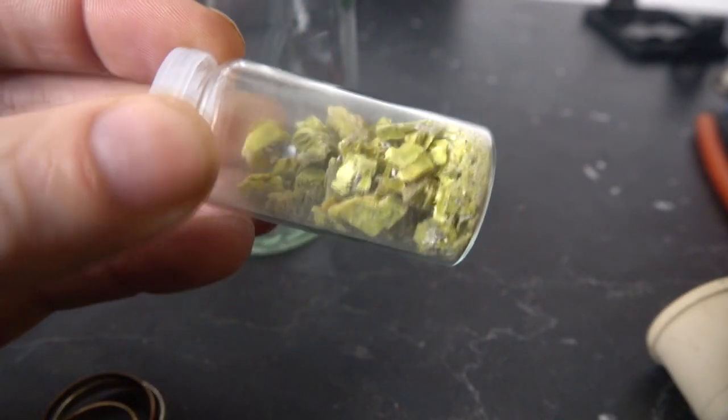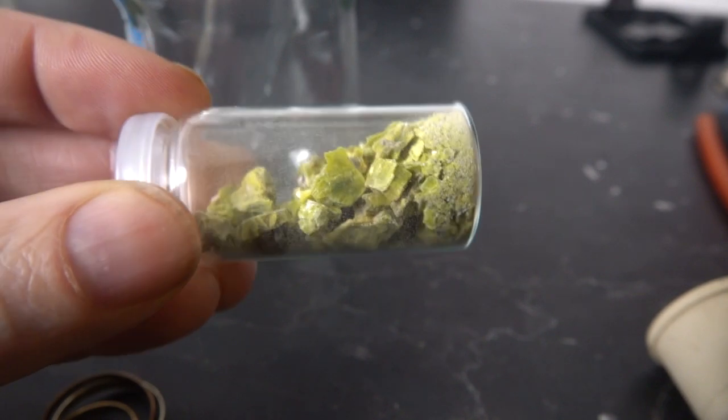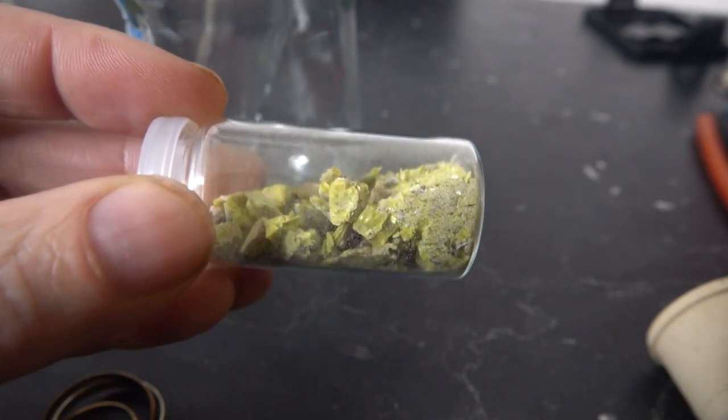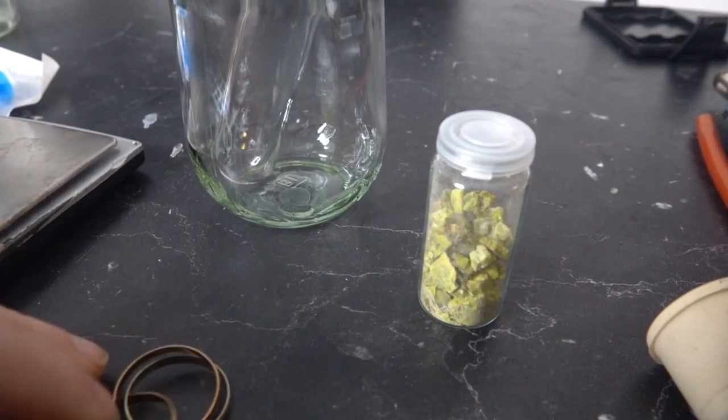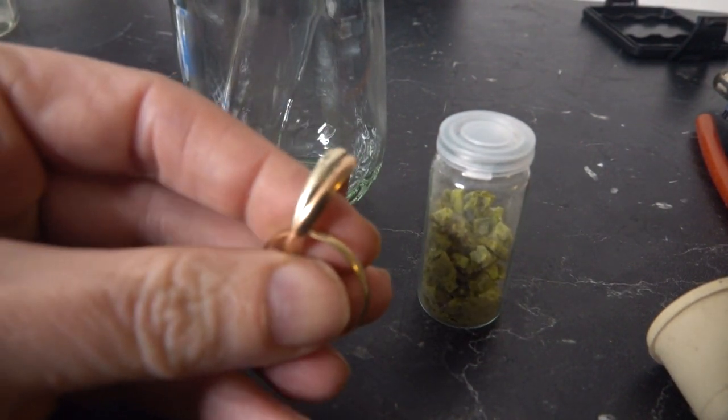So the question is, how do you turn that into uranium metal? Now, Autunite is about 50% by weight uranium. Uranium, by the way, is the same density as gold. This is also not far off the density of gold.